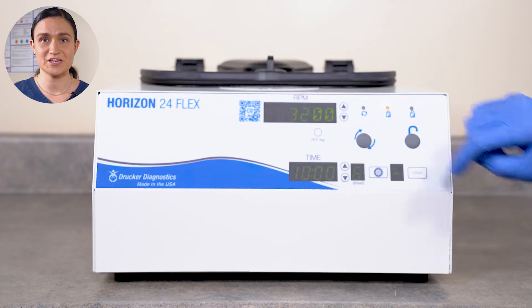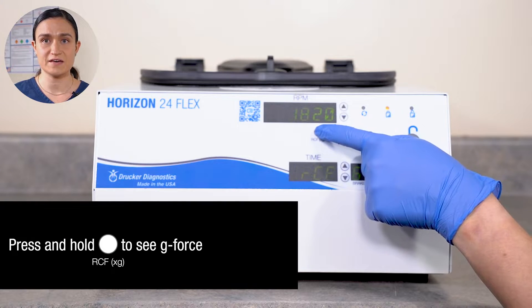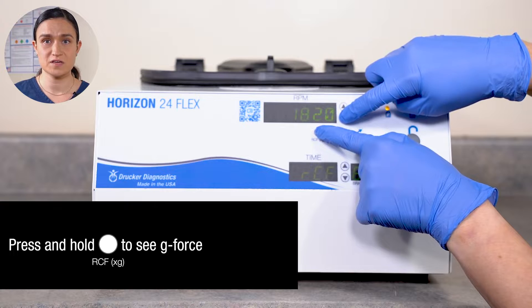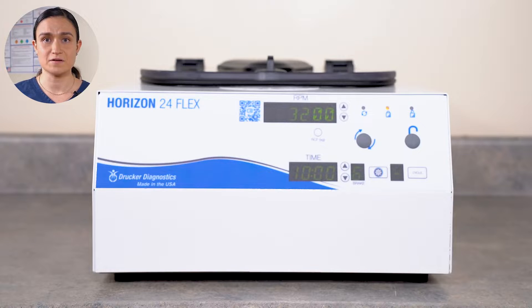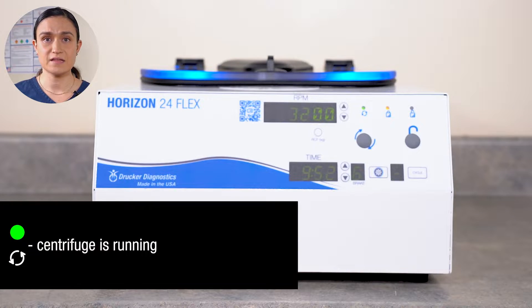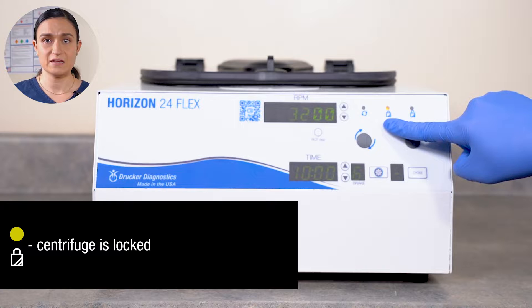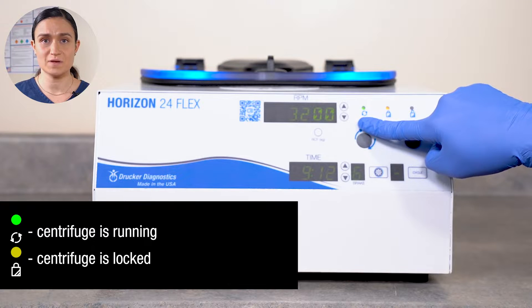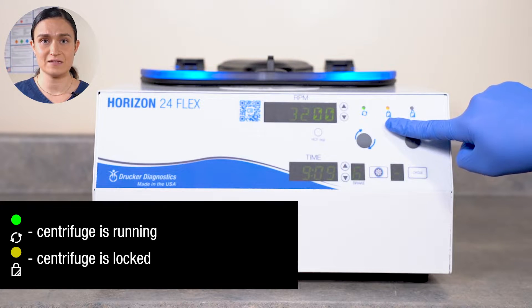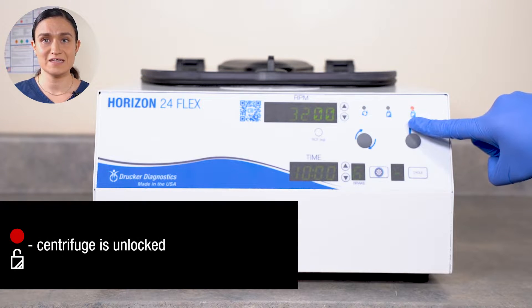If you overshoot or undershoot your desired RPM, you can always use the buttons to adjust. The RCF×G button displays the G-force in the RPM window. If you press and hold the RCF×G button, you can adjust by G-force using the buttons next to the RPM display. The three indicator lights show the status of your Horizon 24-Flex. The left light is illuminated when it's running. The middle light is illuminated when the lid lock is engaged. The lid lock automatically engages when the centrifuge runs, so any time the left light is illuminated, the middle one will be too. The right light is illuminated when the lid is unlocked.